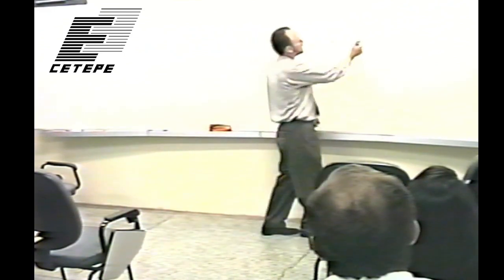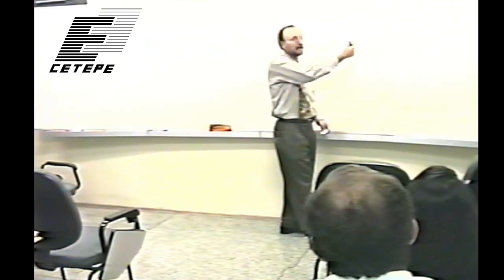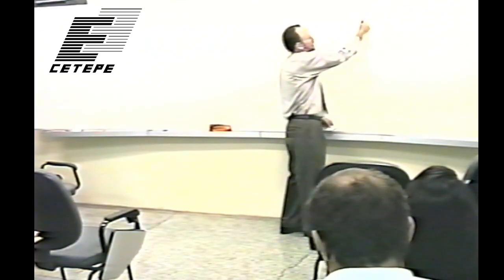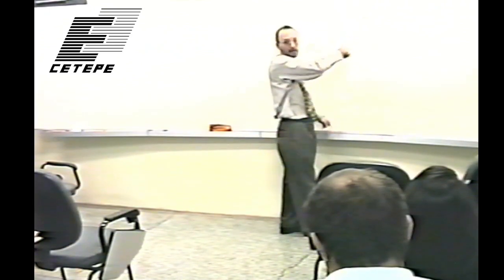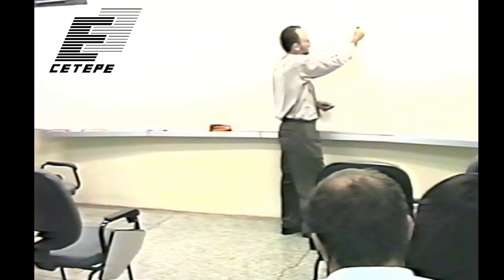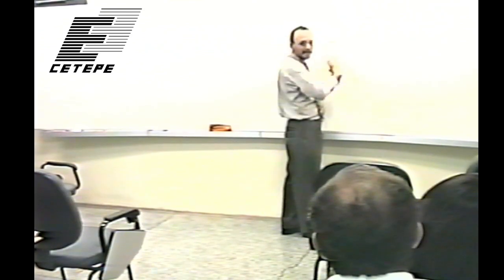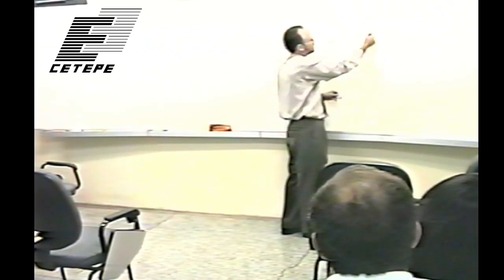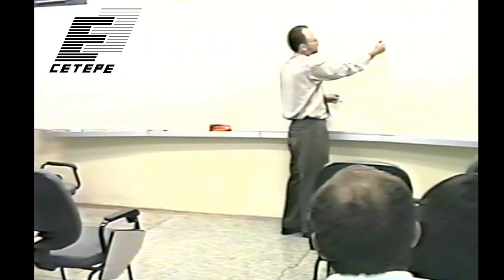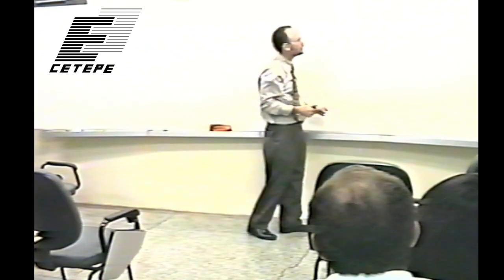And the problem is that the information carried by this X photon had to do with something in the object that, hopefully if it was a photoelectric event anyway, was in line or occurred at this point. But the problem with what's called lateral spread of the light in the screen is that it's going to go off and expose the emulsion over a distance here.